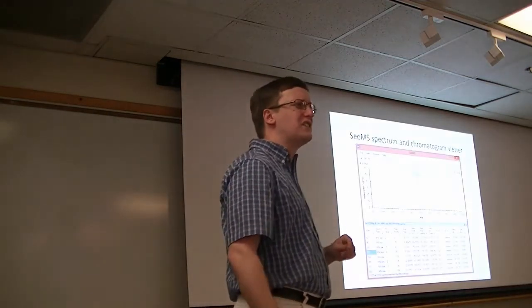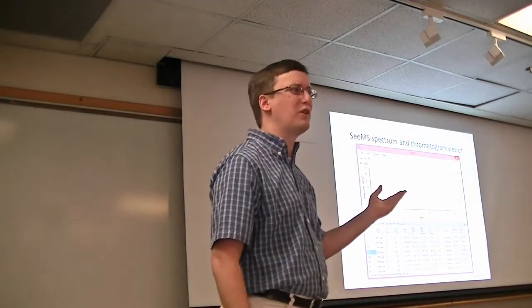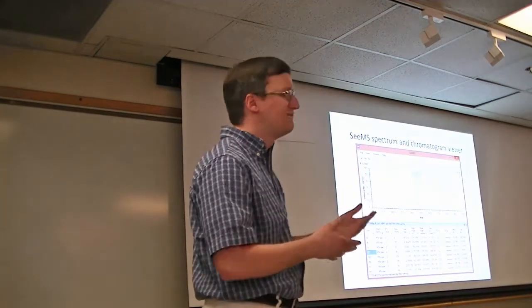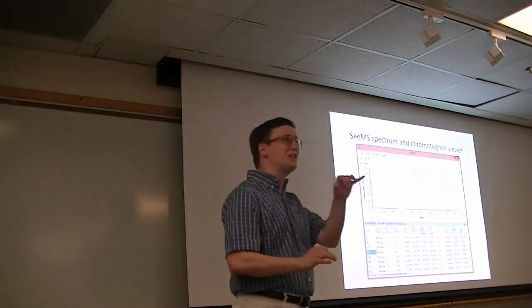A lot of people simply assume MSConvert is ProteoWizard. They'll simply say, I converted these with ProteoWizard version whatever. And it's okay, people understand what you mean, but the tool itself is MSConvert.